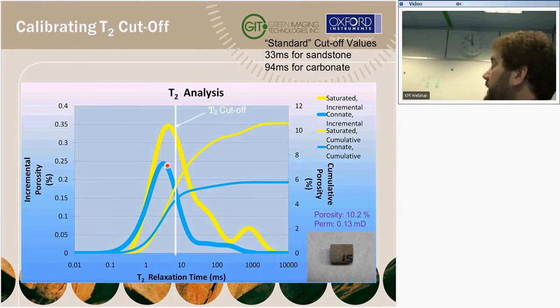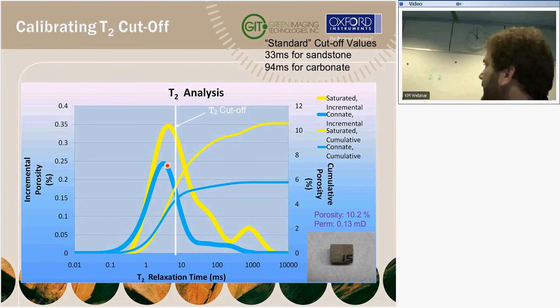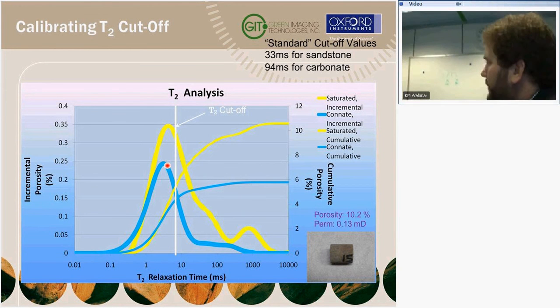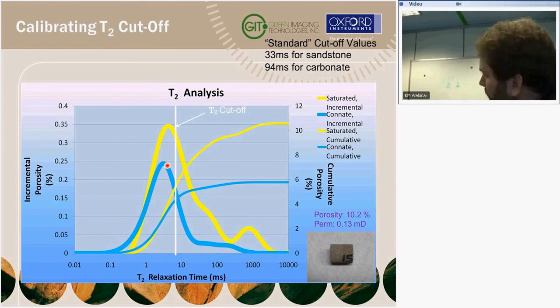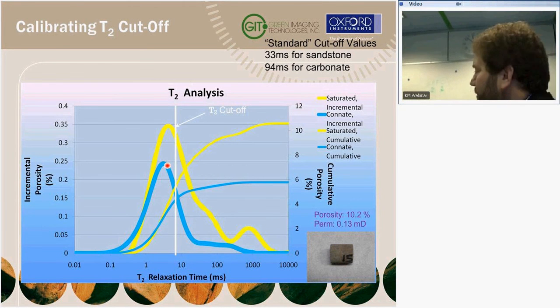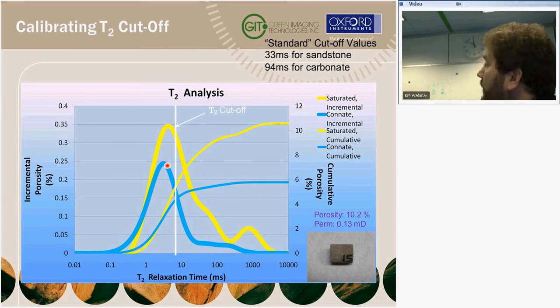If the oil and water signals have NMR properties that are similar, I showed you one in which we use D2O for water, which makes it invisible. That's one trick we do. Another is we can use doping agents to move the T2. I don't want those things. I'd rather use the actual fluids, but we can separate them. Yes, we can quantify, but it is oil.